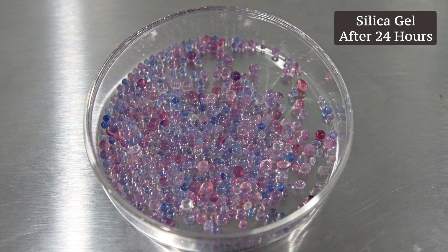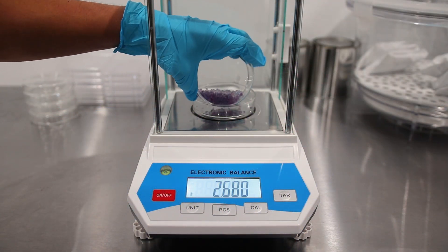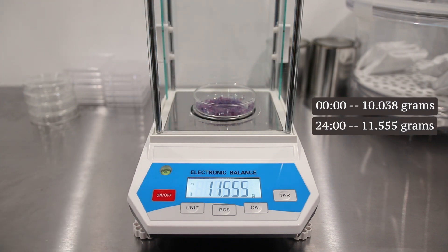After 24 hours we observe the silica gel transitioning to a pink color. Let's measure its weight once again. We obtain a weight of 11.555 grams.